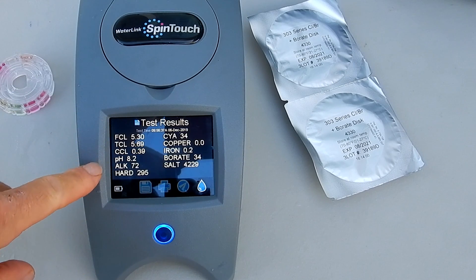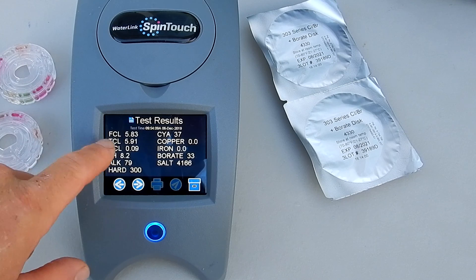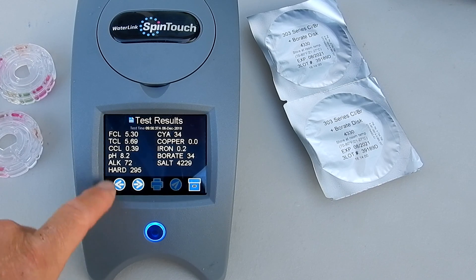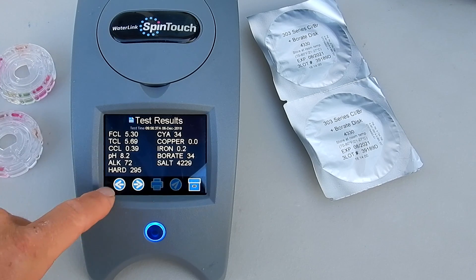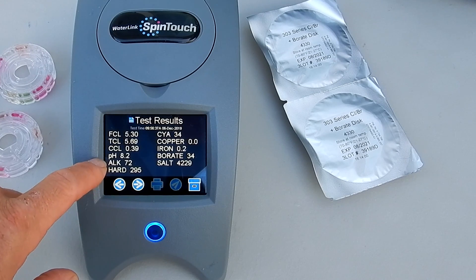It's showing very similar results here. Let me go ahead and put the results side by side so you can compare them. So the last two tests here are side by side. You can see there's a little bit of a difference between the cyanuric acid and alkalinity, but it's still within the margin of error. The borates are coming in about the same and the salinity is pretty much the same. The pH is coming in at the same.